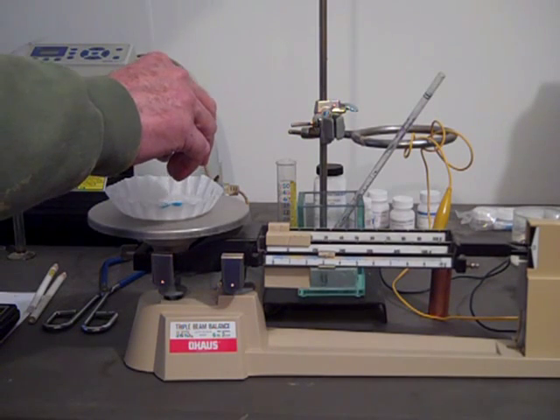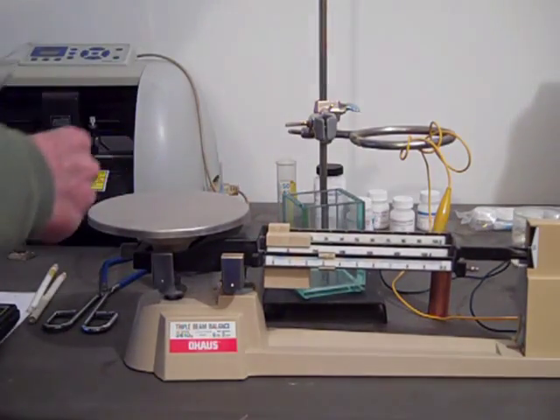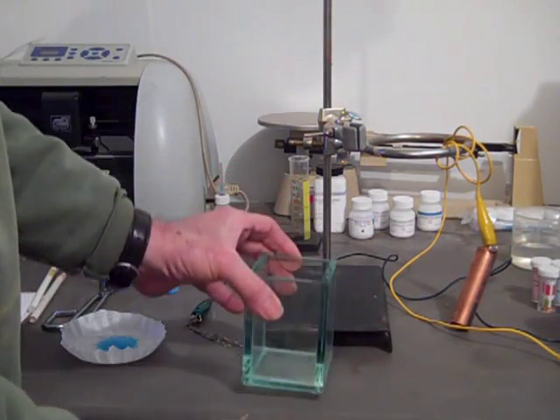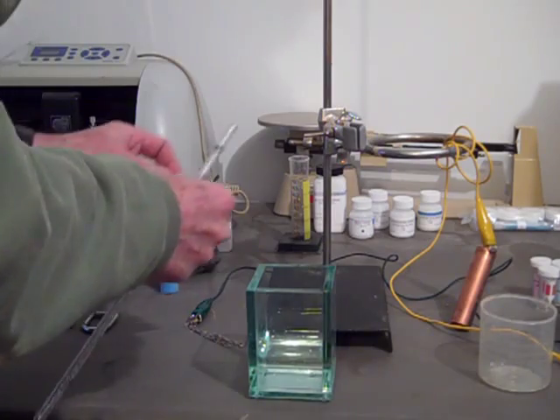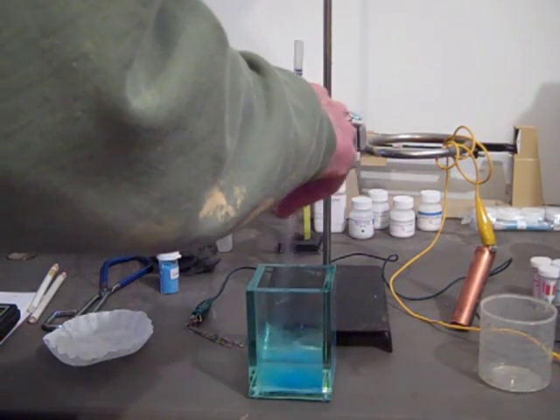You see the scale going up to zero — there we go — and we'll take our copper sulfate off, put our scale back, and we'll mix up 200 milliliters of water, which we pre-measured, and our 3.2 grams of copper sulfate, and let it dissolve.